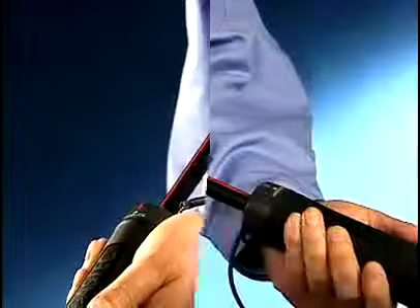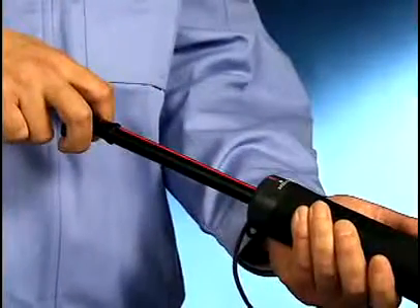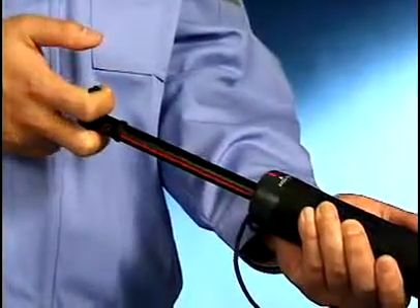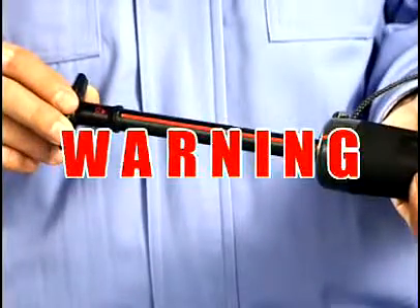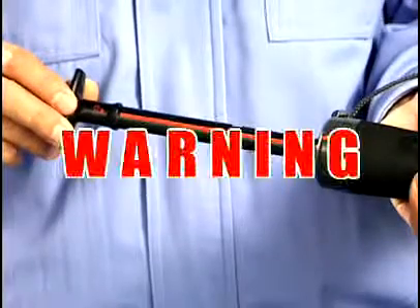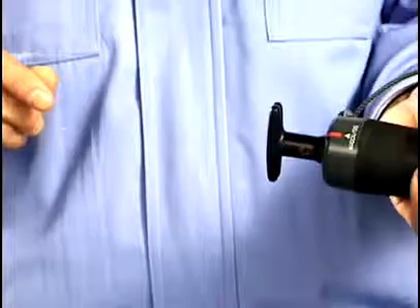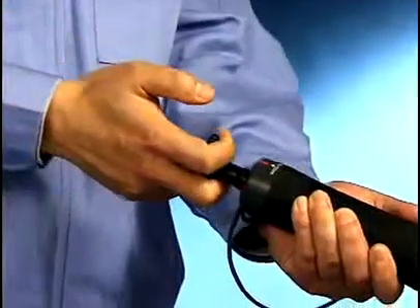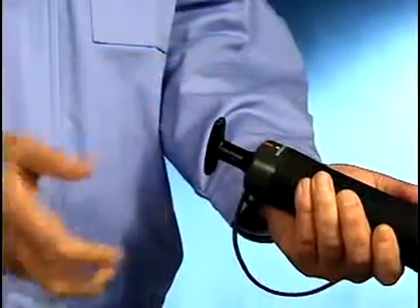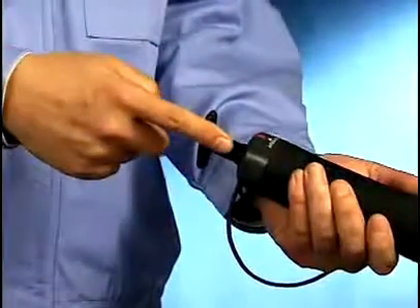Wait one minute. Rotate the handle one quarter turn and set it back, supported with your hand. Be sure to guide it back gradually by applying a little resistance. Otherwise the handle will spring back due to the vacuuming cylinder and possibly damage the pump or cause injury. The airtight condition of the gas sampling cylinder is ensured when it returns to the position where the red line cannot be seen.